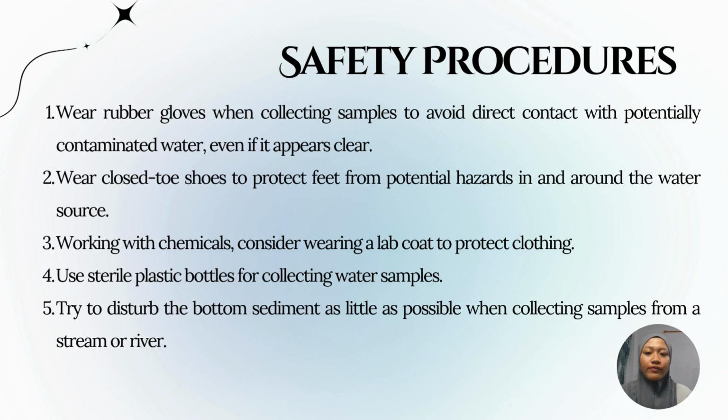When working with chemicals, we need to consider wearing a lab coat to protect clothes. And then use a sterile plastic bottle for collecting water samples, and try to disturb the bottom sediment as little as possible when collecting samples from a stream or river.